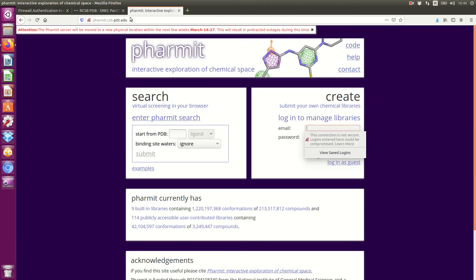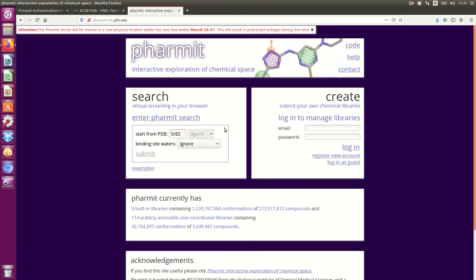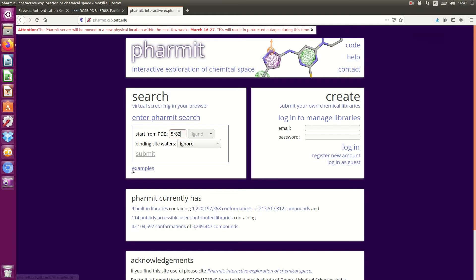Now I go to Pharmit software, an online software, and type this receptor. It's here. I will pause the video to save time. Now I give enter.